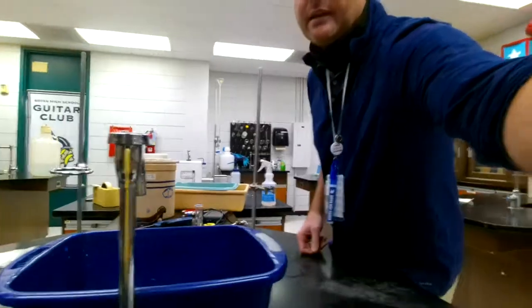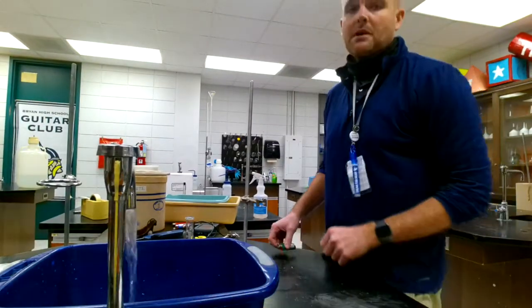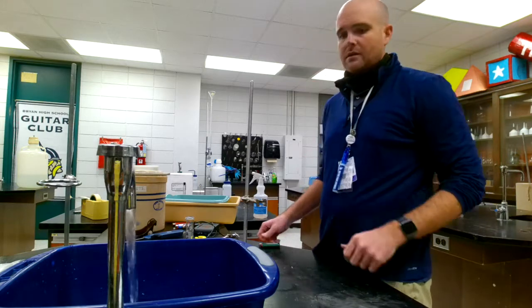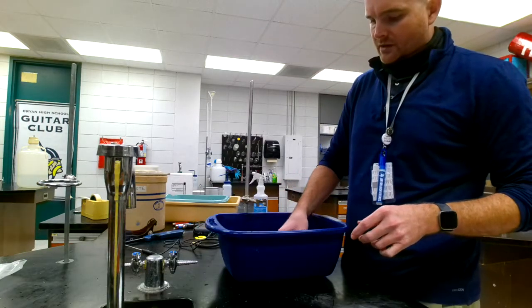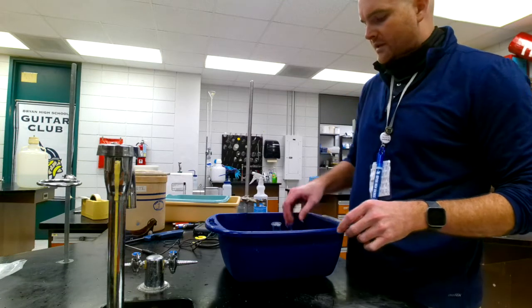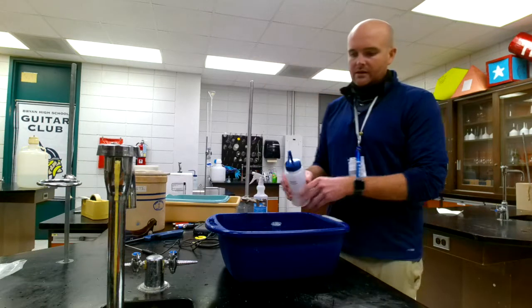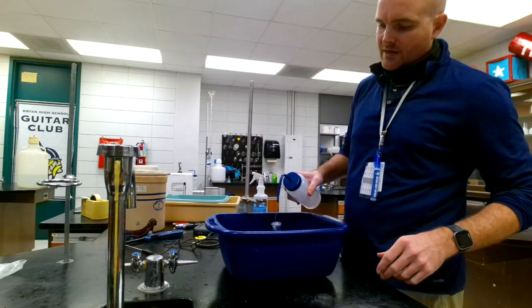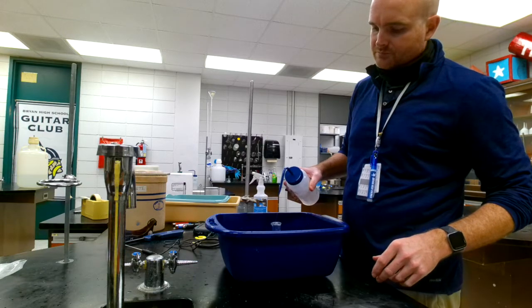Now it's a highly complicated process of filling up a water trough with water. I'm going to fill it all the way up with water. Hopefully I can get it totally full. Go ahead and top it off. I want to get it right up to the top, all the way over.